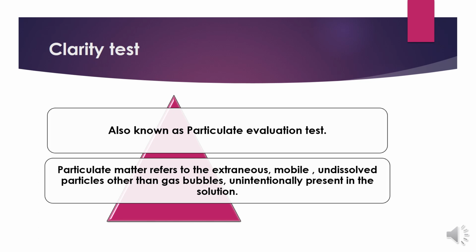So basically they are extraneous, undissolved and mobile, and unintentionally present in the solution or in the sample. Such particles, whether extraneous or undissolved, shouldn't be present in the solution, especially when the solution is to be prepared as a parenteral preparation that is going to be injected into the vessels.